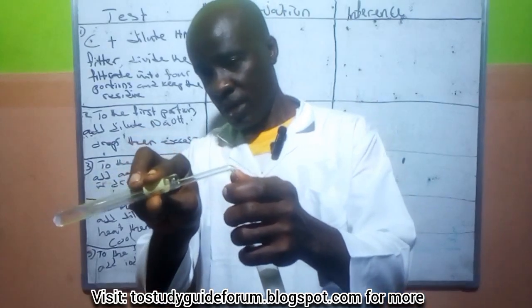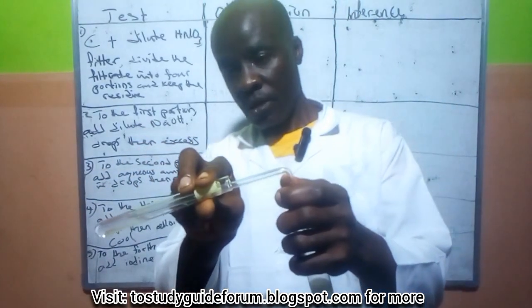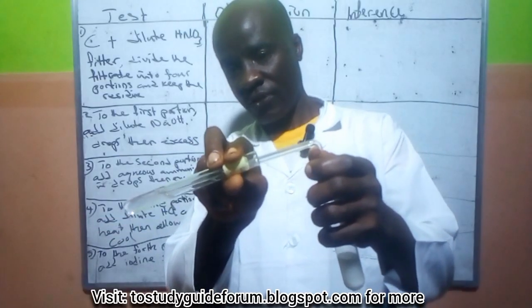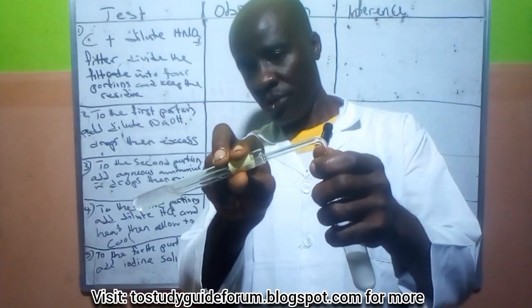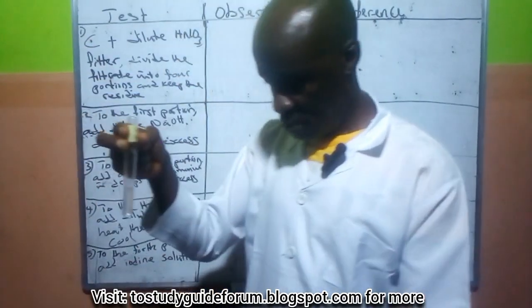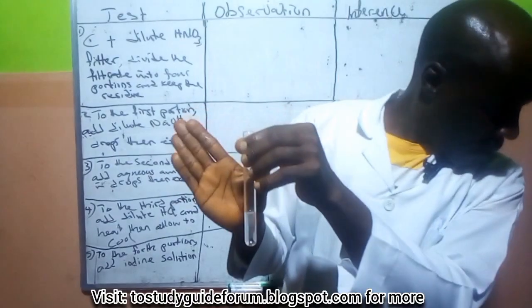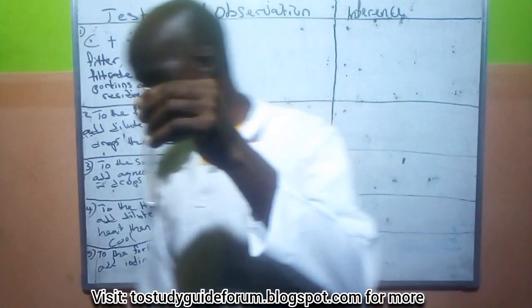Now the gas that just came out, I tested because we have lime water there. In the information, lime water should be provided. Now I've tested this. It turns lime water milky. This is what we have. The gas has turned lime water milky. Look at it very well. How do I make it obvious? I need a black background. Let me change the background to make it better.